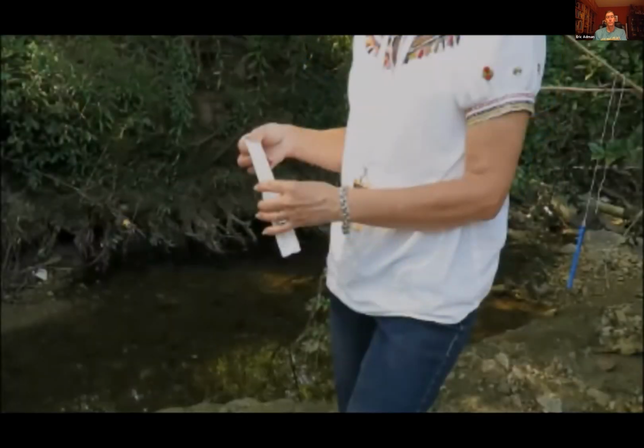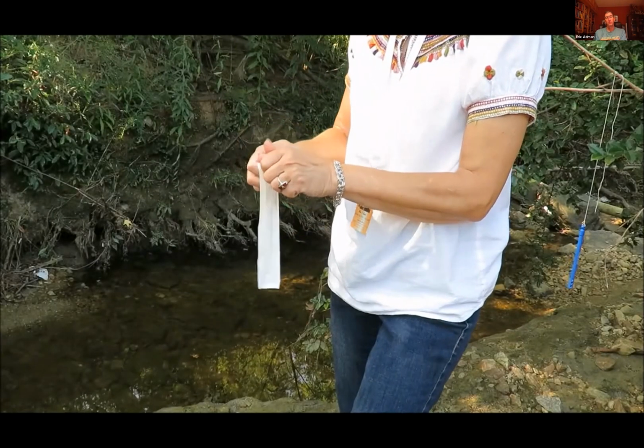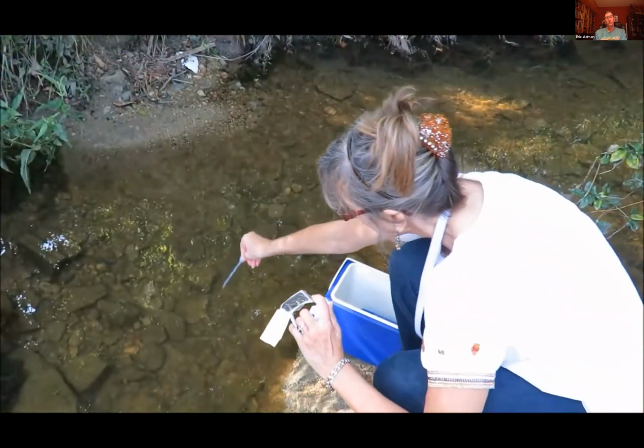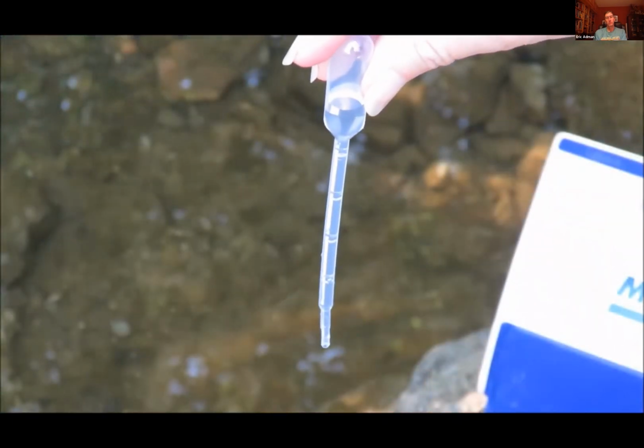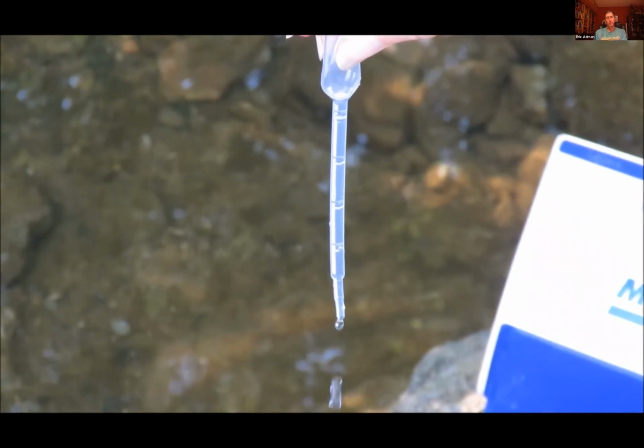Upon arrival at the site, measure the air and water temperatures. For instruction on how to measure these temperatures, please watch the video called Water Chemistry, Air and Water Temperature. Once you are ready to sample, unwrap a sterile pipette from the bulb end and avoid touching the tip of the pipette with anything except the sample water. Fill the pipette with sample water. Be careful to not disturb the bottom of the stream.